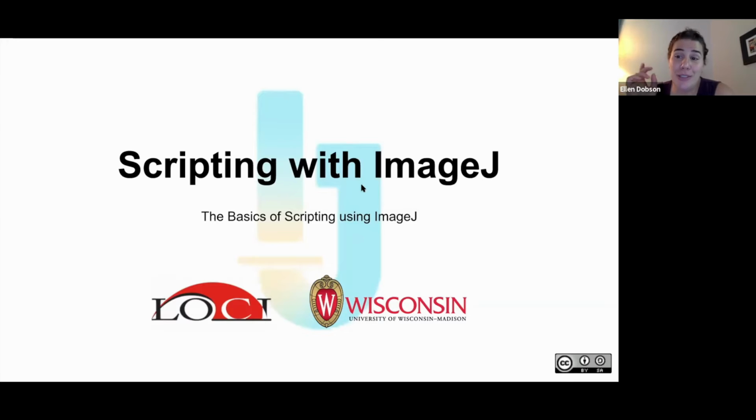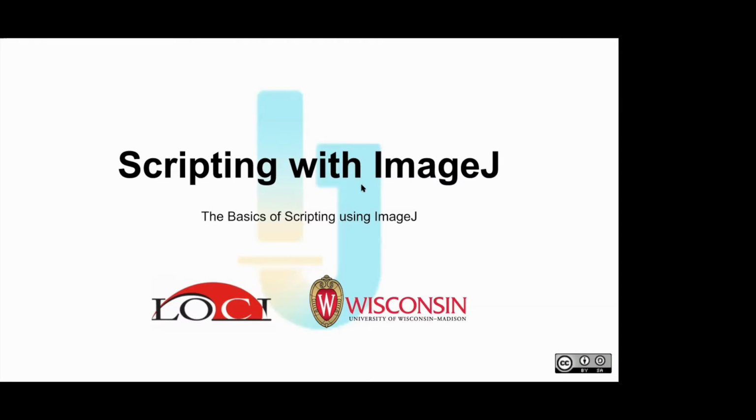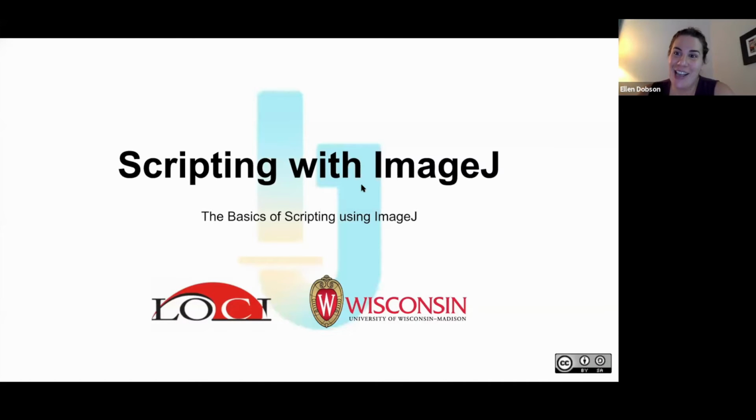Yeah, I guess it depends on the biological question that you have, whether or not you could just do a Z-plane projection, right, and then do the measurements, or if, biologically speaking, you need per-slice information. But you can apply exactly what we just did to a Z slice and save the ROIs from each slice, yes. Okay, and then you just add them all up. Is that the way you would go about it? Again, it depends on what your question is, biologically speaking.